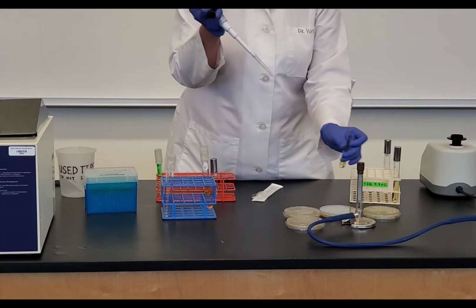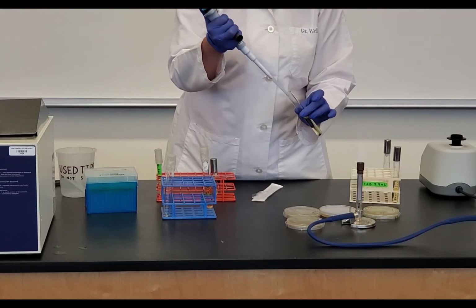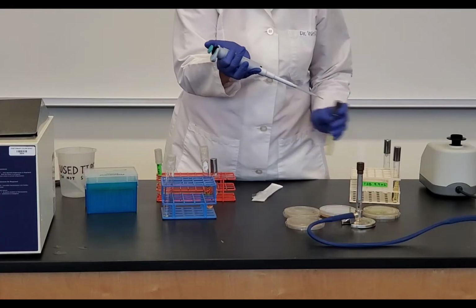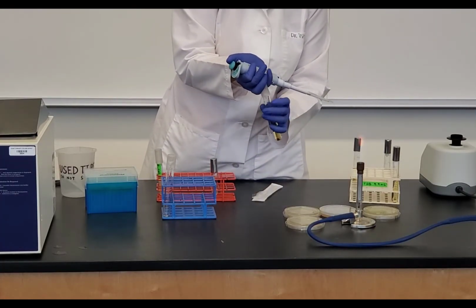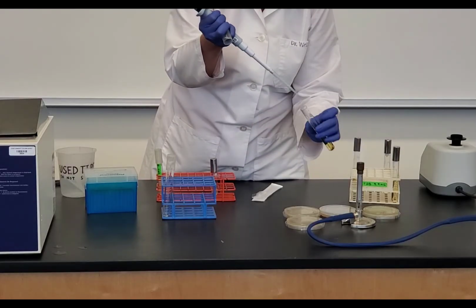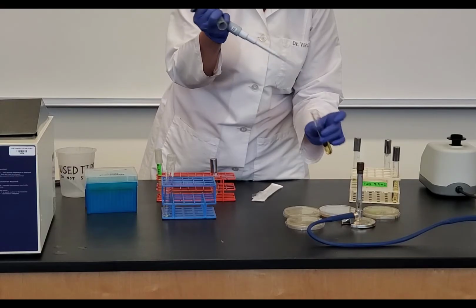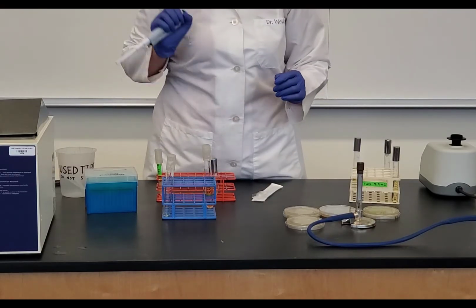Take the cap between my pinky and ring finger, flame it, go in, draw up my 100 microliters. Flame it, cap it, and I'm going to add that to my melted agar deep. Flame the opening, add it in, push to the second stop to get it all out, flame it, cap it, get rid of my tip.